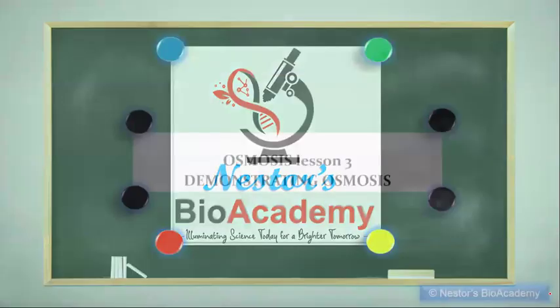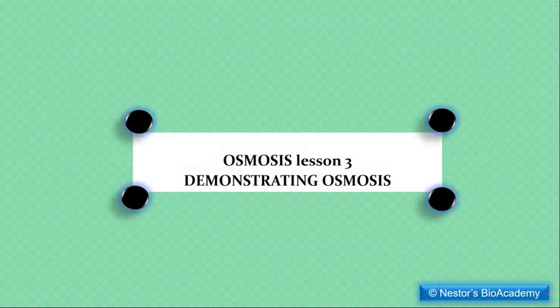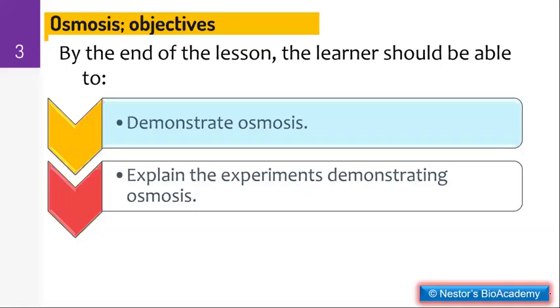And today we are going to go through our third lesson on osmosis, with the main objective of this lesson today to demonstrate osmosis. So our main objectives today are to, one, demonstrate osmosis and also explain the various experiments which we always use to demonstrate osmosis. We are going to look at the various ways we can always carry out investigations in our laboratories to check whether osmosis has taken place or not.